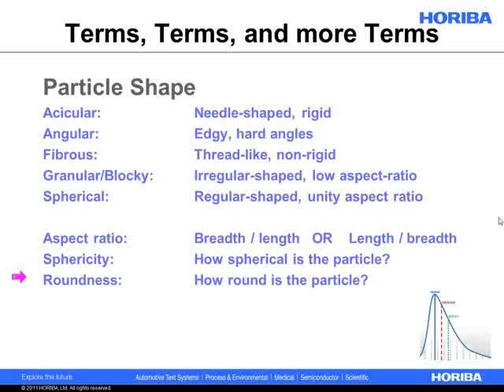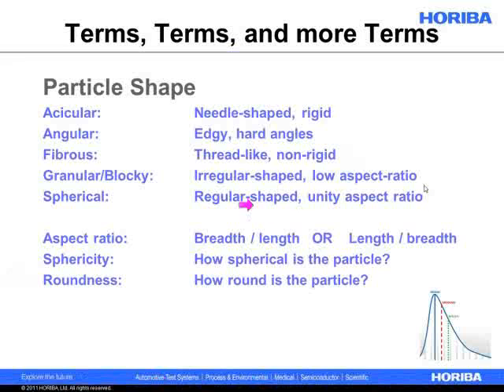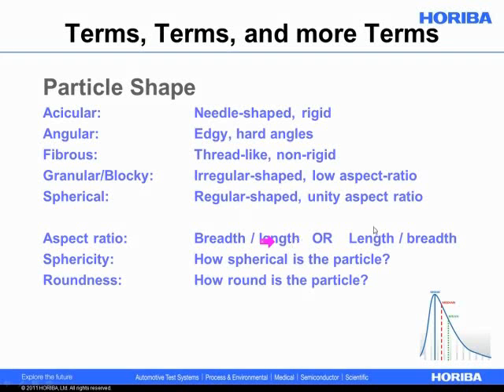Maybe a little bit hard angles, sort of like an abrasive particle. Maybe are they acicular, needle-shaped? Granular, good.